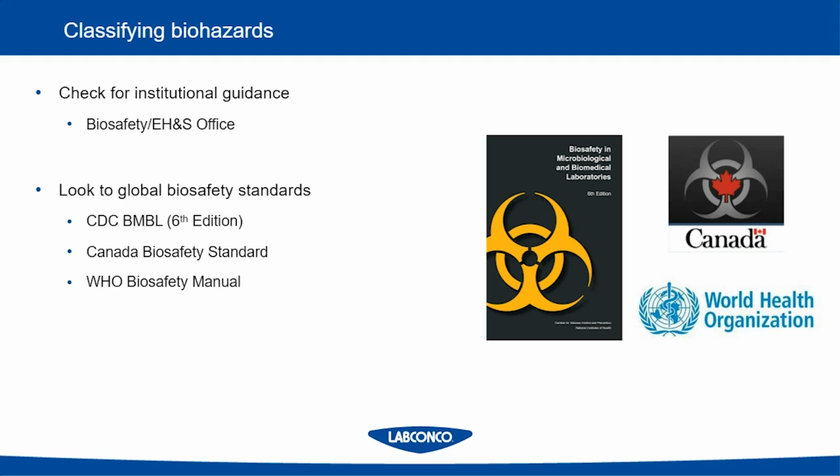Next, you can look to the global standards. So this is kind of the book I mentioned to the right. The Biosafety in Microbiological and Biomedical Laboratories book is a free guide put out by the CDC. It's currently on its 6th edition, and you can download it online.